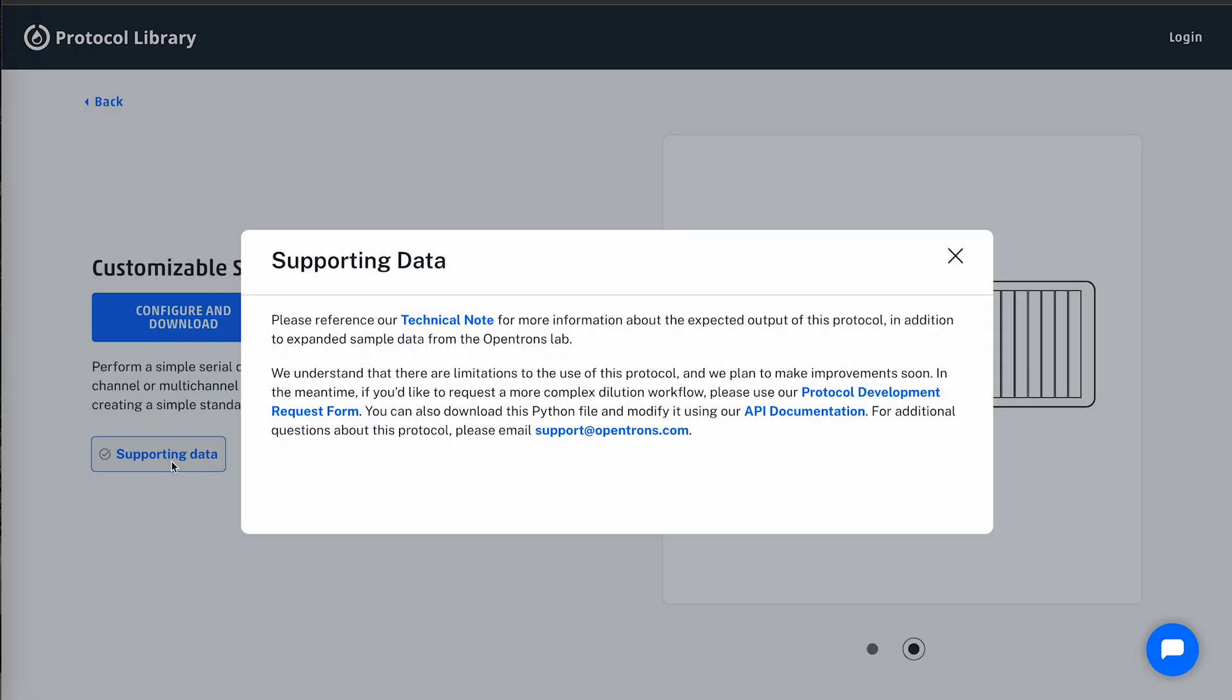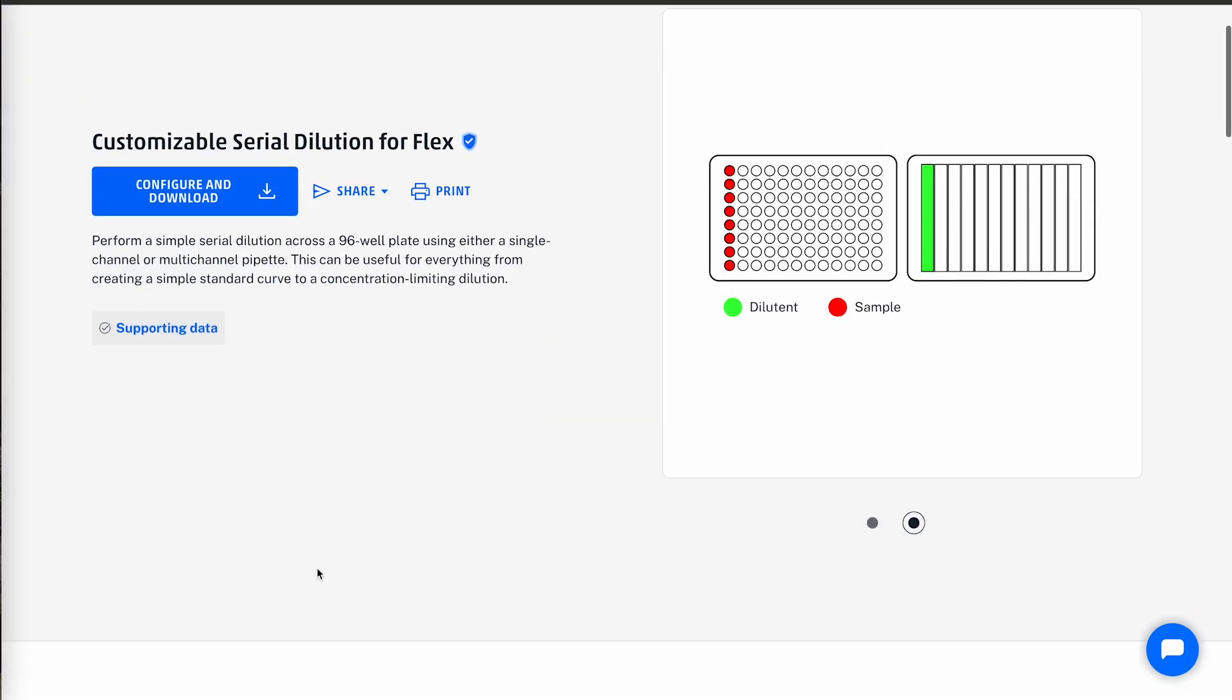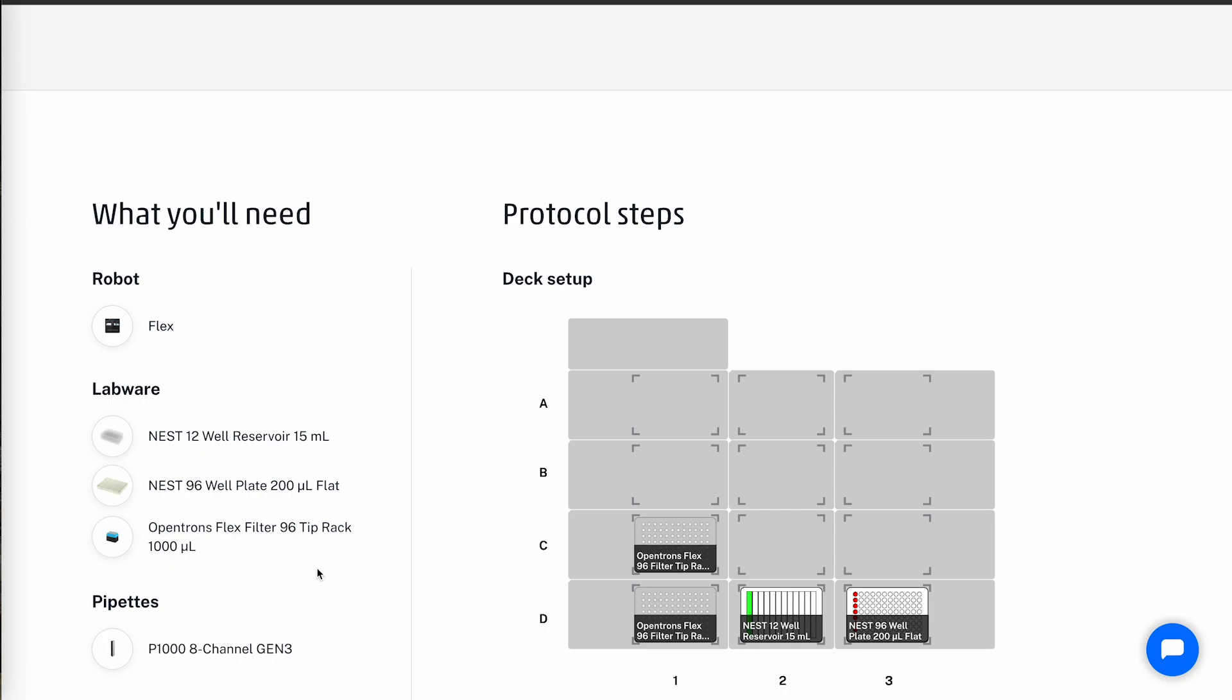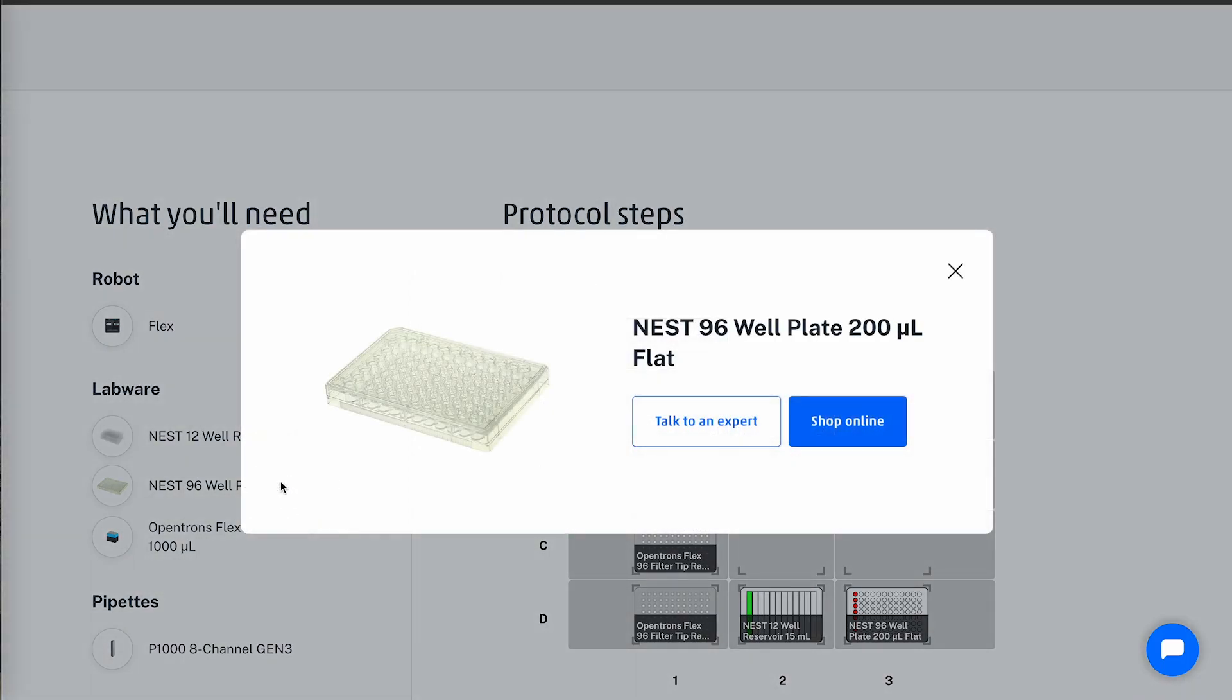Clicking on the supporting data button will display the application notes and other important information about the protocol. Under the what you'll need section, we display the equipment needed to run the protocol. Clicking a labware name will provide you with purchasing information for the labware.